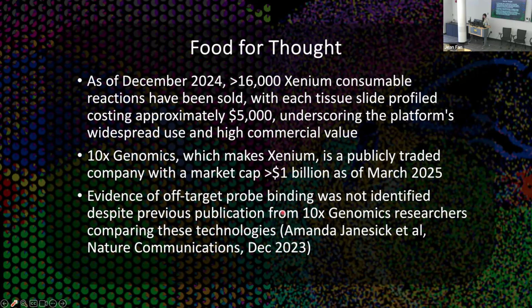And evidence of this off-target probe binding was not previously identified despite a publication from 10x researchers comparing across these technologies. So I hope this last story exemplifies how the complementarity between industry and academia fosters a more rigorous, transparent, and reliable scientific process, ultimately to the benefit of all of us consumers and even the public.